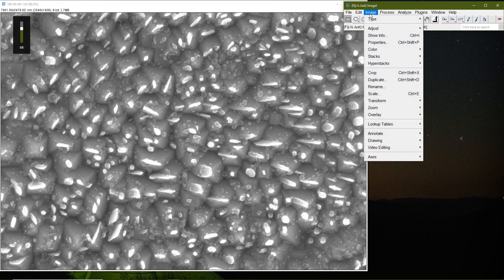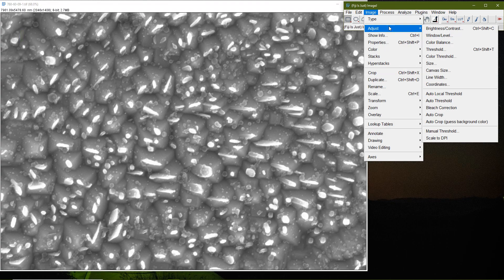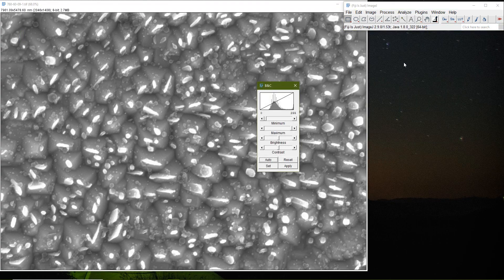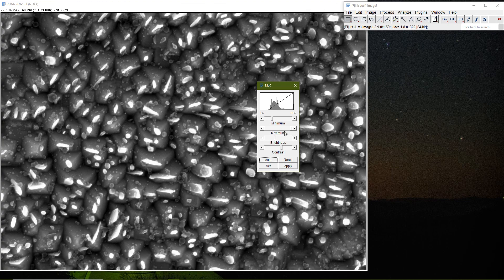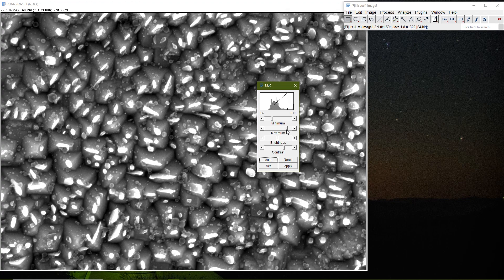I go to Image > Adjust > Brightness and Contrast. I want to separate my particles from the matrix. I bring the brightness down and adjust it so my particles are bright enough — so I have a very clear bright and dark fringe to separate them out. But they're not very clear, and this is where we require manual human intervention.